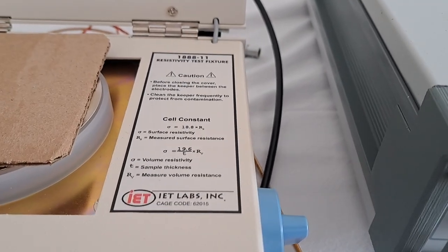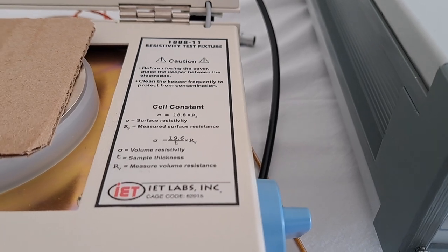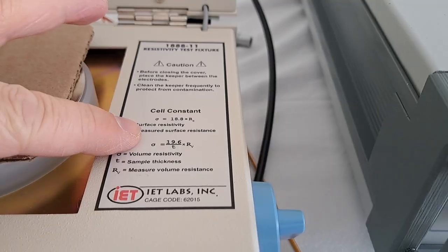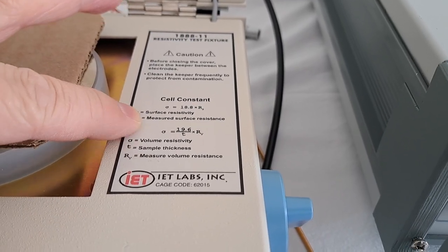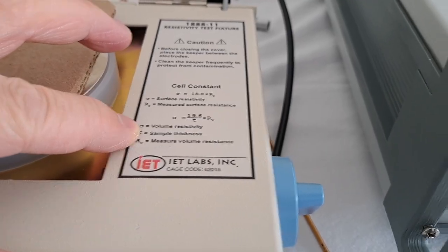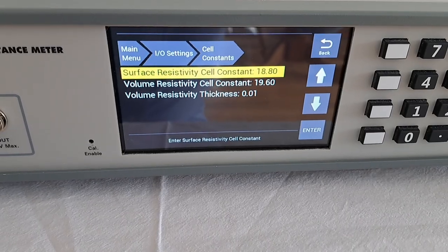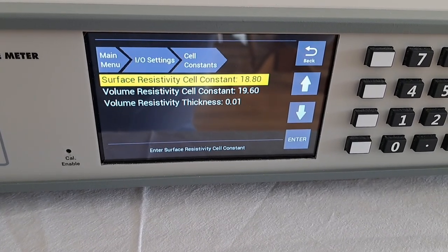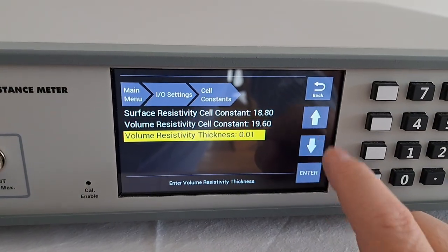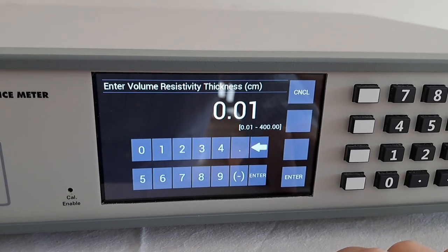Please note on the 1888-11 there's a label right inside that shows what the cell constants are for volume resistivity and surface resistivity. The value 18.8 is for surface resistivity and 19.6 is for volume resistivity, as labeled. If you look at what's entered in the meter, you can see those are already pre-configured for you. The only thing you have to do is determine the thickness of your material.